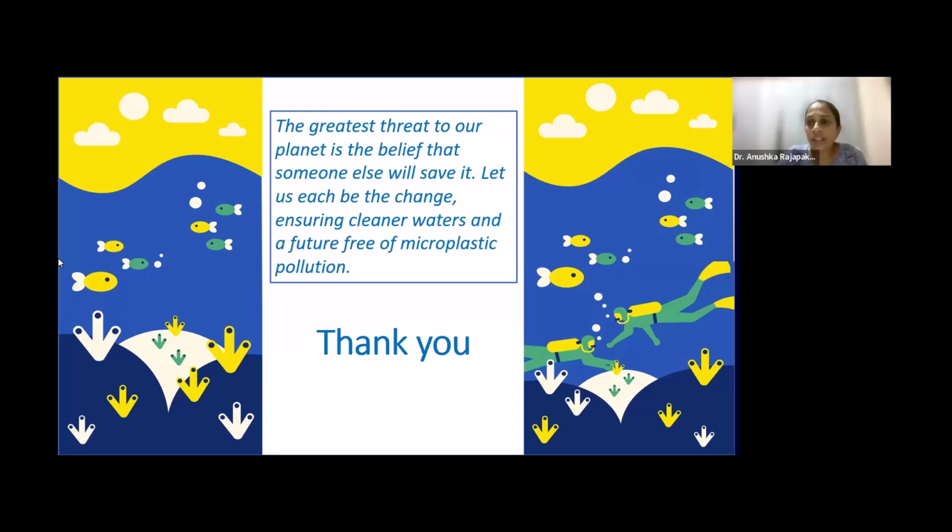In case of analyzing PET microplastics in commercially available bottled drinking water, what will be the sampling method?